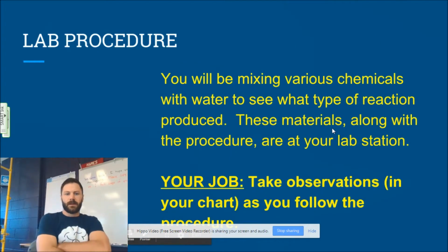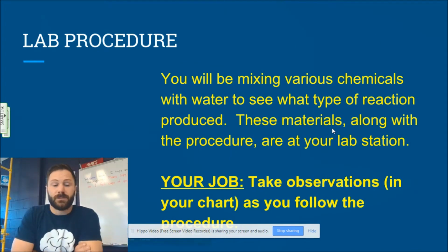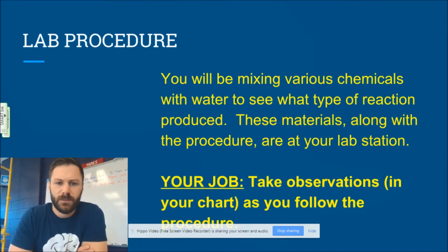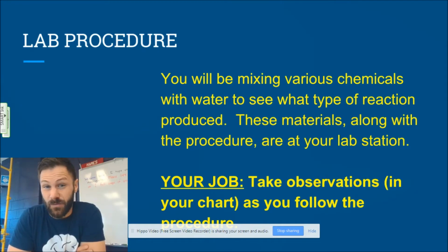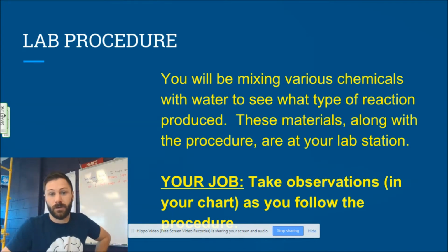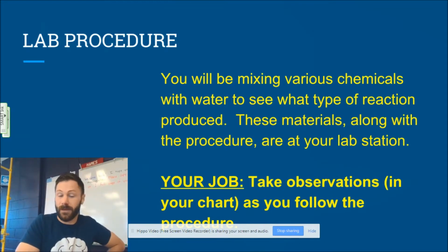I'm not going to tell you what these chemicals are just yet. You're going to experience those in your lab when you get to your procedure. Basically, you'll be mixing various chemicals with water to see what type of reaction is produced, an exothermic reaction or an endothermic reaction. These materials, along with the procedure, are at your lab station, which, if you're watching this by video, will take you to a lab station in just a moment.